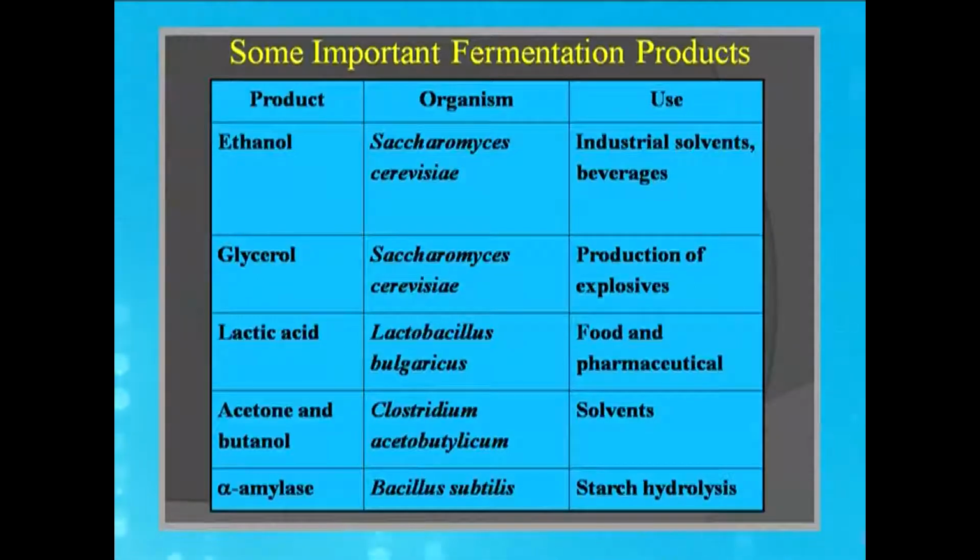but the common feature, all of these will use a biological agent, more so a microorganism, for the product to be produced. And that is why, as we are going to grow microorganisms, we require a sterile environment as well as properly controlled parameters like pH and temperature.